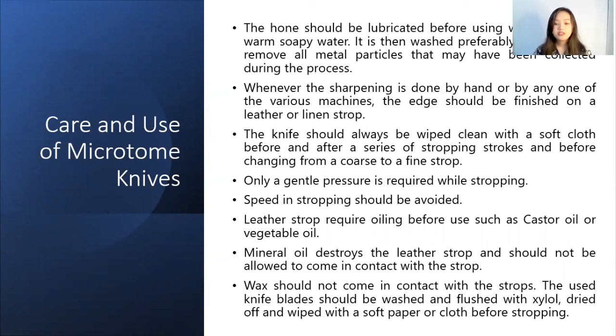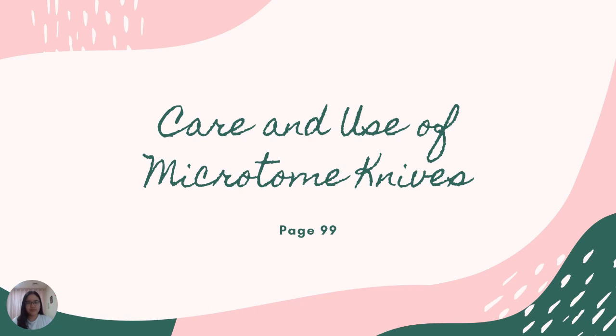The used knife blades should be washed and flushed with xylol, dried off, and wiped with a soft paper or cloth before stropping. We will now be discussing the care and use of microtome knives.